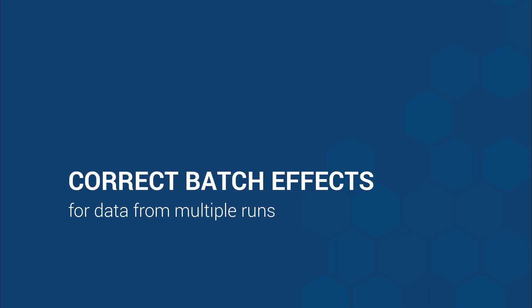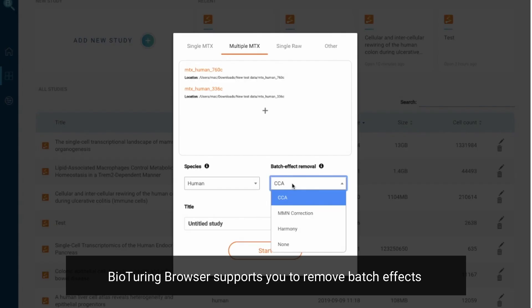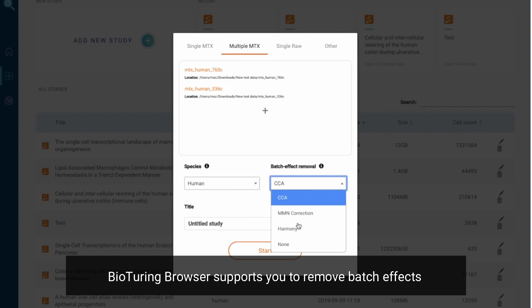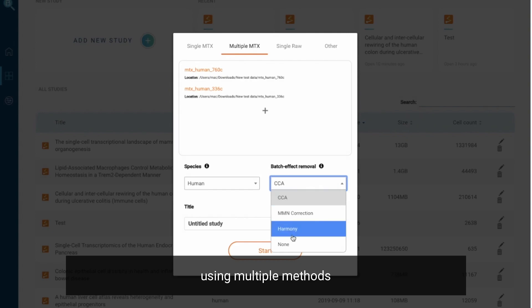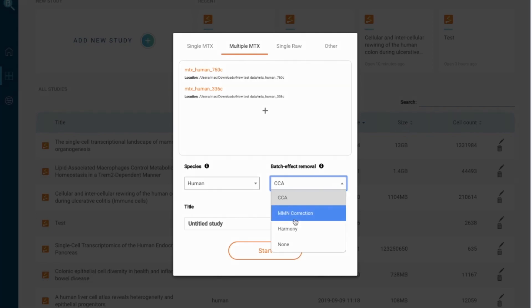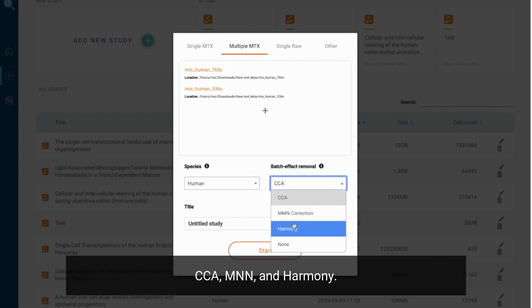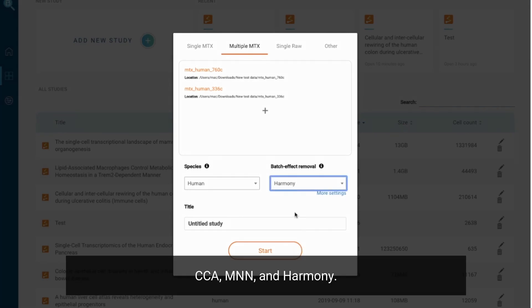Correct batch effects. If you have data from different runs, BioTuring Browser supports you to remove batch effects using multiple methods: CCA, MNN, and Harmony.